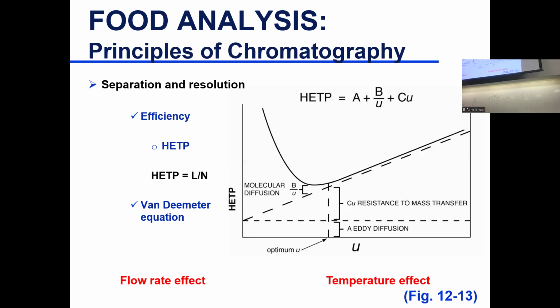So Gary is going to talk about capillary columns in GC. Sometimes in HPLC we use capillary columns too.